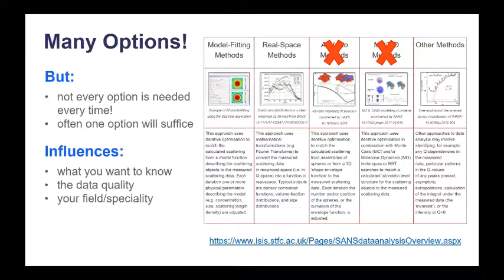And the reason for that is quite simply that there is other well-established, very capable software out there to do these. For example, the ATSAS suite from the European Molecular Biology Laboratory, work of Dmitri Svergun, and SASSIE out of NIST, the work of Joseph Curtis, are two leading examples. So SasView doesn't do the ones I've just put a red cross on, it does do the others.